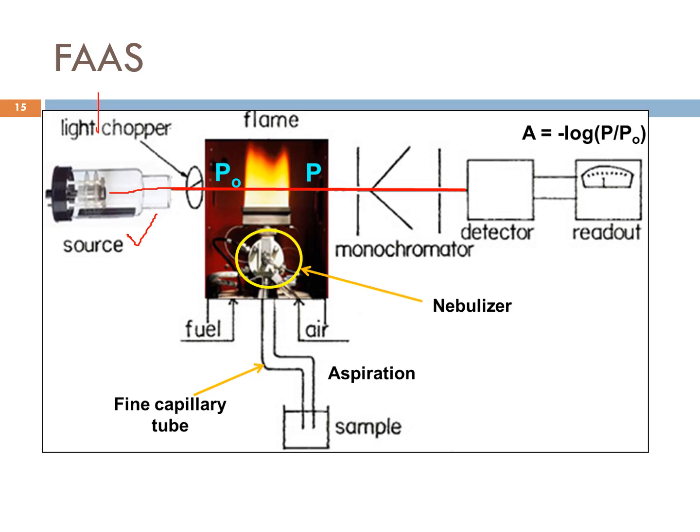Let's say we want to analyze sodium metal, then the cathode of the source must be made of sodium metal. So the four processes from earlier take place, and it will emit the characteristic radiation of sodium, P0. Then when it enters the flame, the atoms in the flame, in ground state, for example sodium atoms, will absorb the radiation from here. Since the emitted radiation is specific to sodium, other species in the flame will not absorb this radiation. The radiation is directed only at sodium.